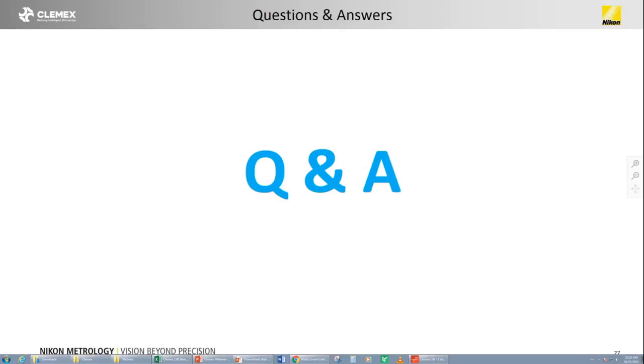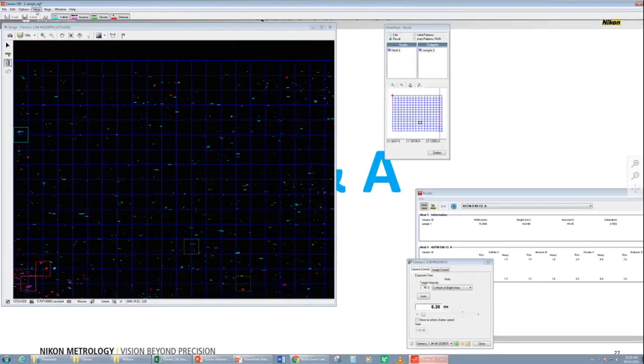Okay, thank you. Another question that we have is, our samples are flat metal sheets. How do you handle that? If you have a flat metal sheet, what we typically tell our clients is to stack them together in a mount, and then while they're in this mount, to polish them. Once you polish them, we have an option in our software, which I have here.